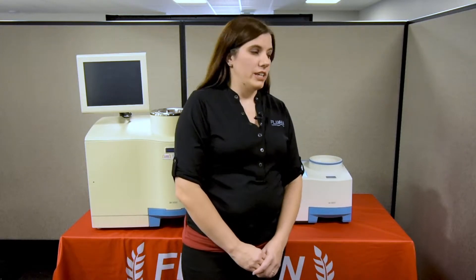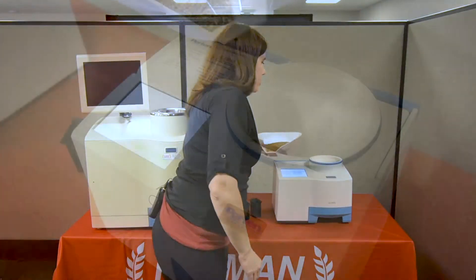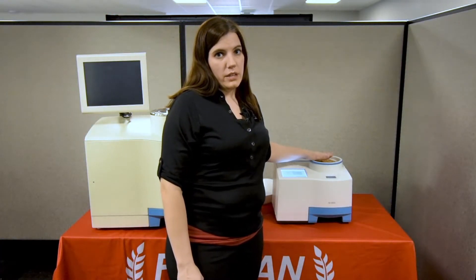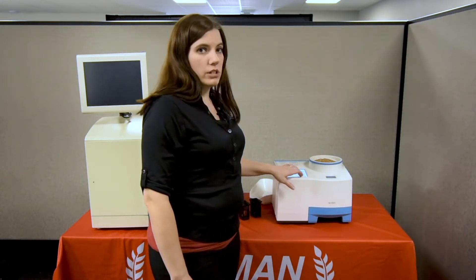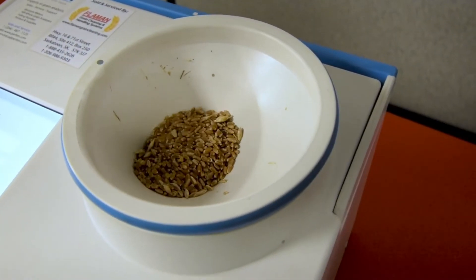This unit is very easy to use. You just select the grain you are trying to test and pour the sample in. There is a maximum fill line so you don't need to weigh the sample or measure it at all, and you just hit start. The machine will make a light value, a dark value, and test 10 subsamples of each grain.